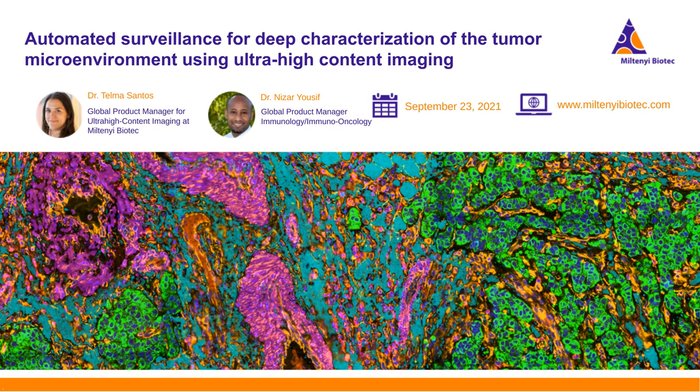So this comes a bit as a continuing part of what I said before. Because we always take pictures in between cycles after a signal erasure, we make sure when we're processing the images that we are removing the signal that might still be there because of autofluorescence. And this way we are sure that the images that come out after processing are really ready to be analyzed without all these issues.